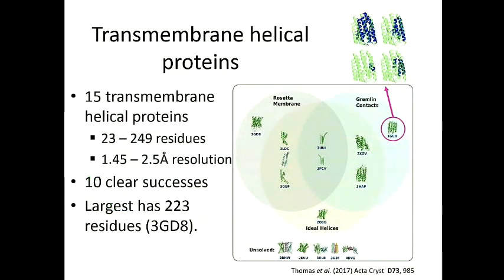We also looked at transmembrane proteins. Quite a few of them solved, again, over a range of sizes. We introduced a very simplistic kind of ideal helix mode just to convince ourselves that we were doing more than producing search models from Rosetta, which were basically helices. For the transmembrane ones, the ideal helices, even our simplistic implementation, works surprisingly well, but these two cases here, which were the lower resolution cases, actually needed explicit modeling to solve as well.